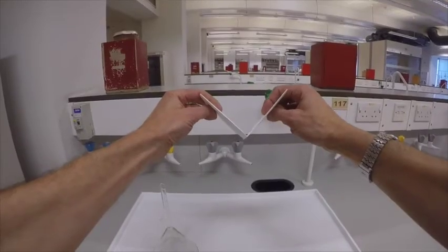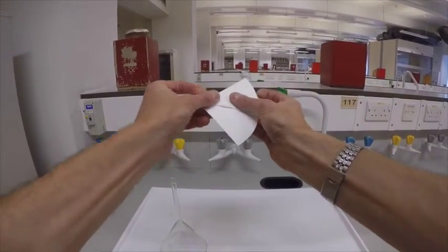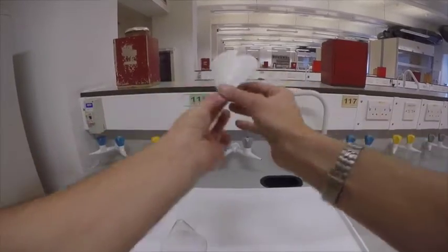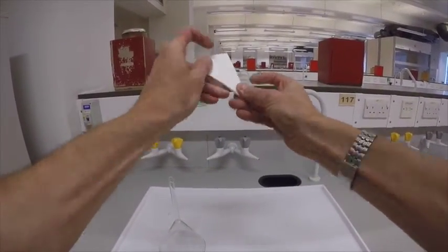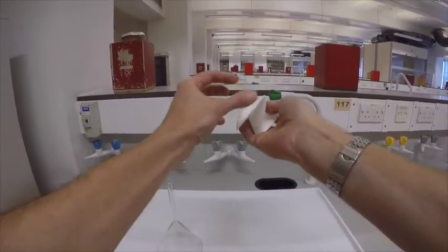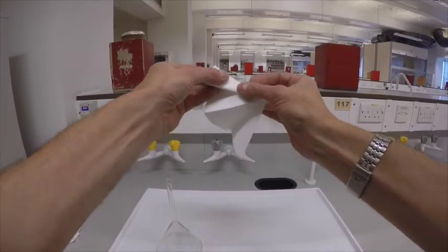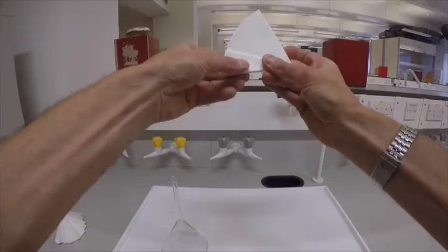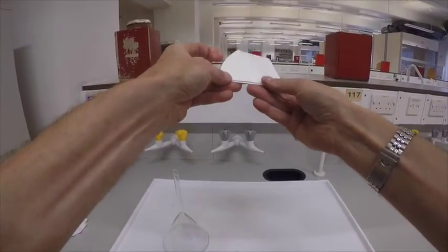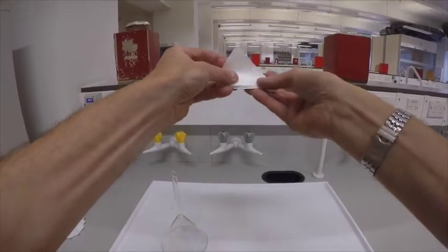If you look at this filter paper, it's in the shape of a V. What we'll do is fold back the two halves, and the result is that we're going to end up with a W. Now we're going to do it again. The crucial thing is that we're going to fold it back on itself over and over.